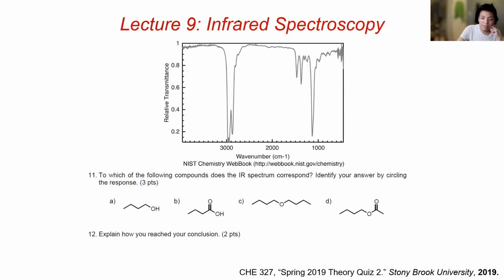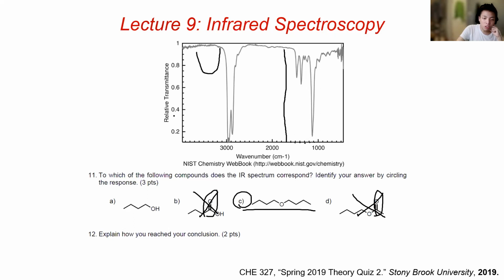Anyone else? Yeah, right. That's correct. So here there are carbonyls, right? But we don't have carbonyl peaks here, so we can say bye-bye to them. And then we don't have any alcohol stretch, so nope.